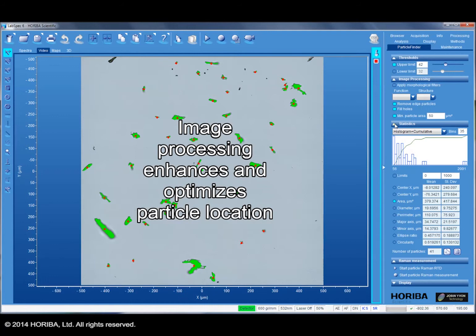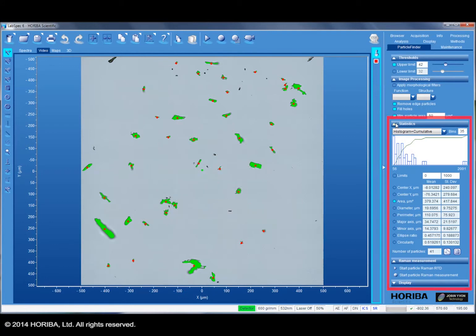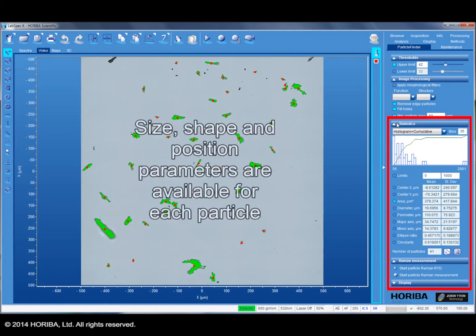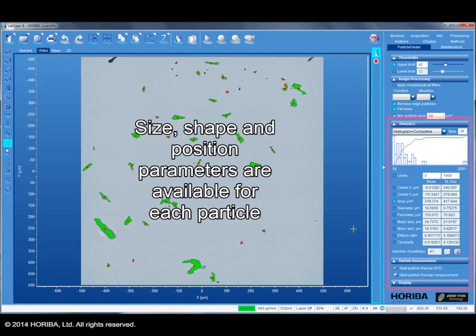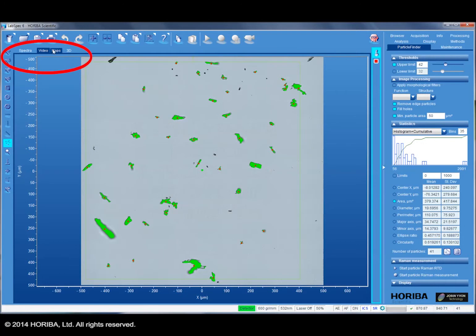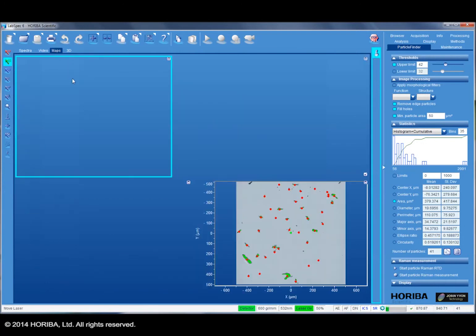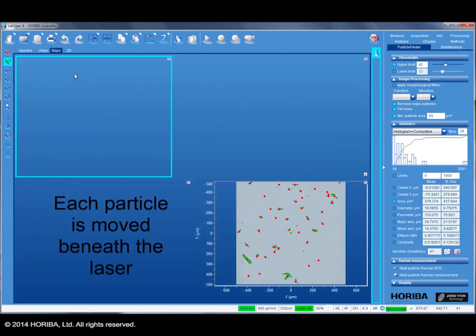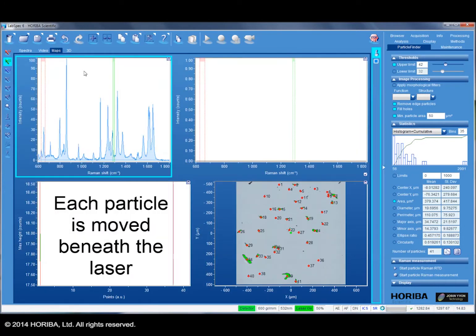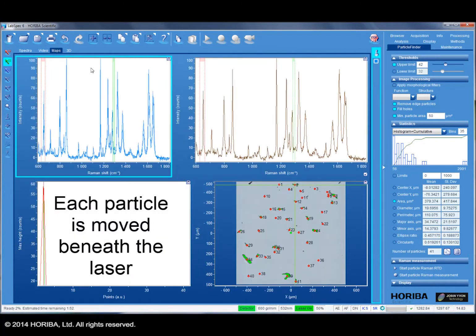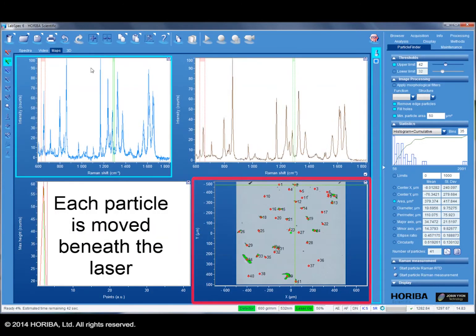Once done, size and shape parameters are displayed and are available for each individual particle. The Raman measurement can now be started. The software automatically moves the center of each particle beneath the laser beam.